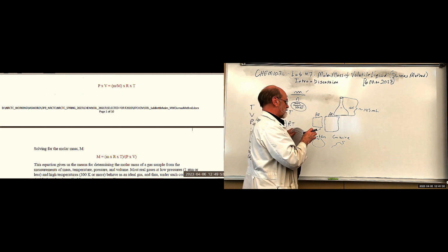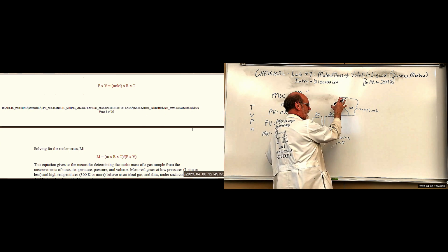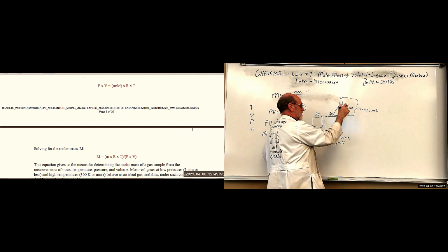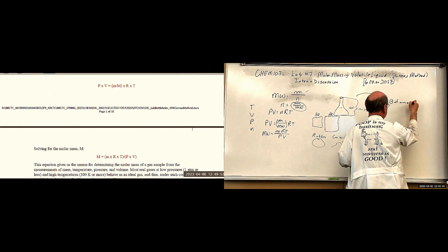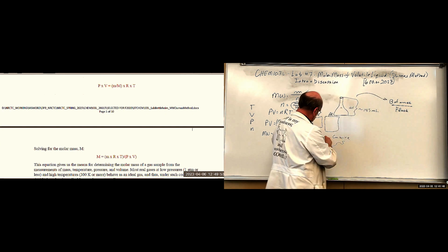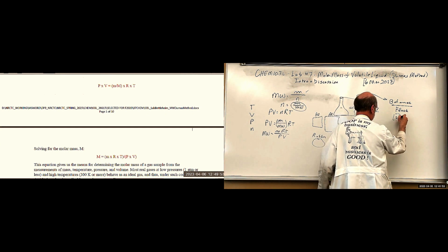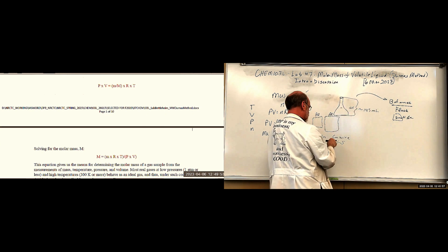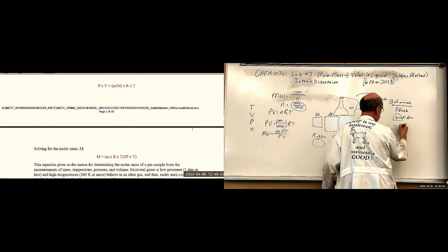And what you want to do is when you weigh this flask on your balance, this goes on the balance, what goes with it? Well, you need the flask on the balance. You need the small aluminum sheet. Okay. You need what's holding that aluminum sheet down, which will be the copper wire.